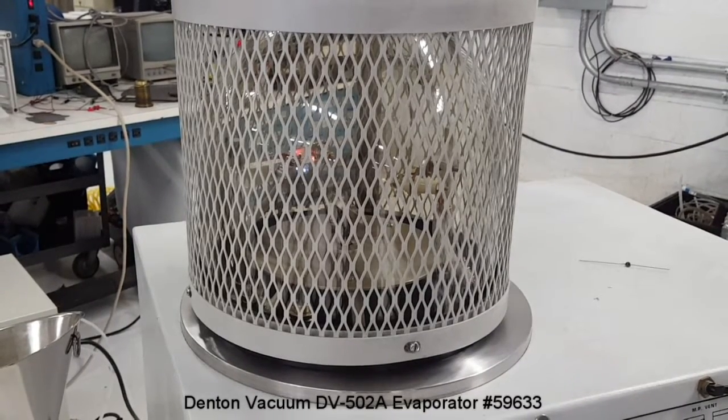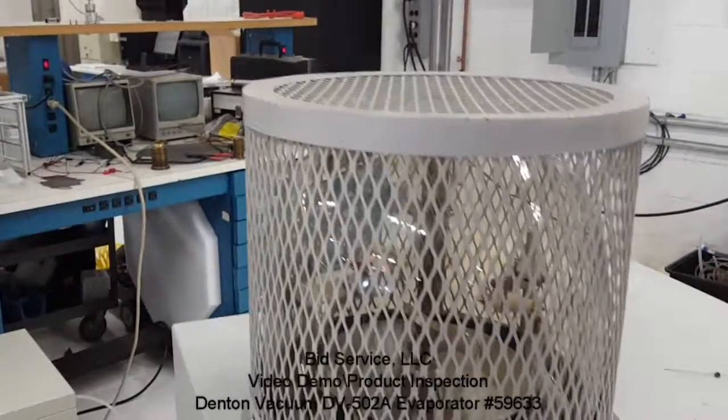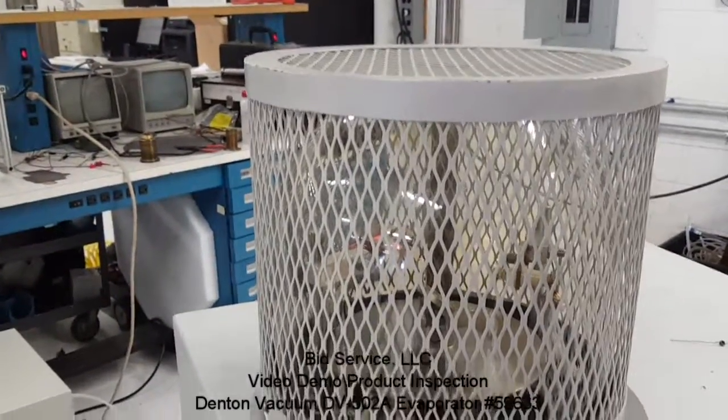It is recommended to use protective glasses when the thermal evaporator filaments are turned on.